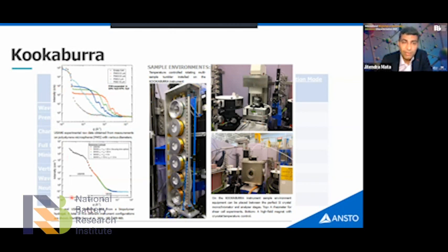Now, many experiments, as I mentioned before, actually combine that with the SANS, which is on this length scale, and it gives you this very huge Q range. This is our sample environment, the one we use most. It is called the 6-position rotating temperature control tumbler. For example, when you are studying material with the USANS, you have matter which is settling down, let's say if you are studying an aqueous system. So you want to actually rotate them in the beam, perpendicular to the beam, and that way you can have a nice homogeneous mixture.